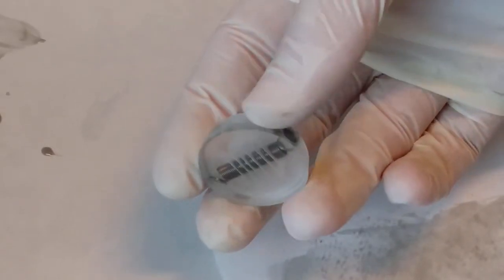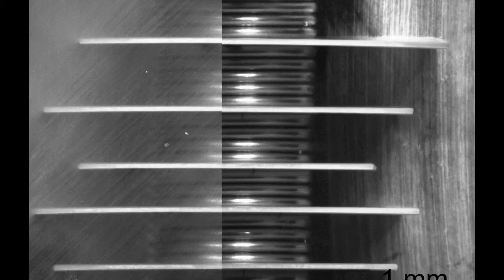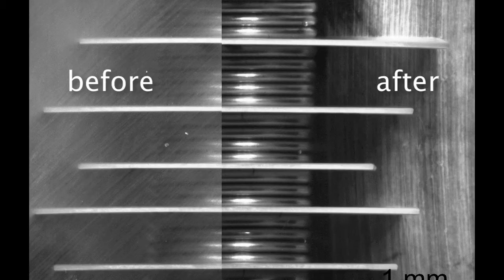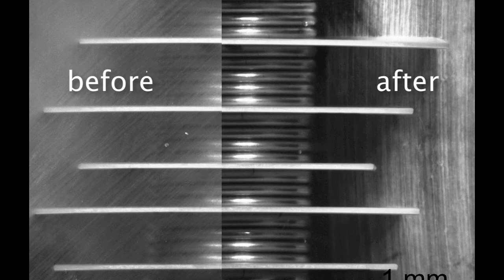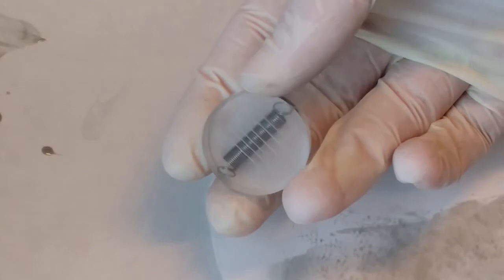Now you see that the dull surface has become much more glossy and transparent. The spring you see inside the plastic is now clearly seen. This stage you achieve when you reach the three micrometer diamond paste.